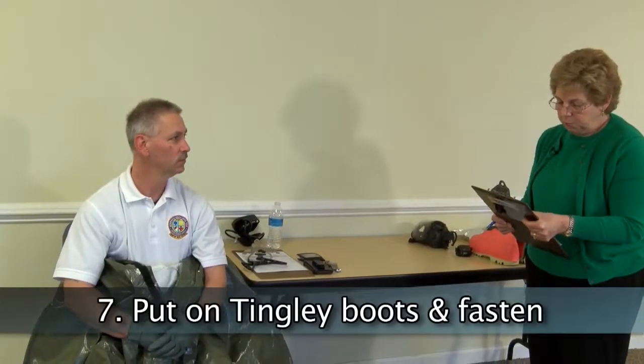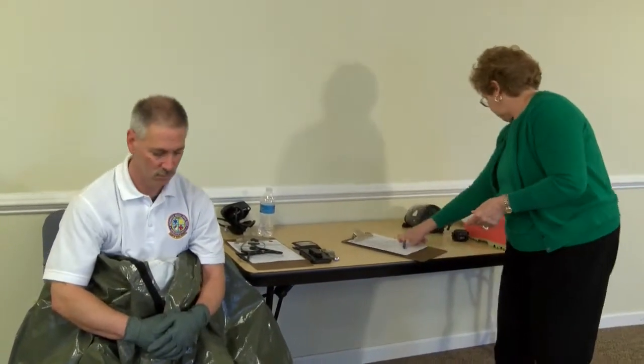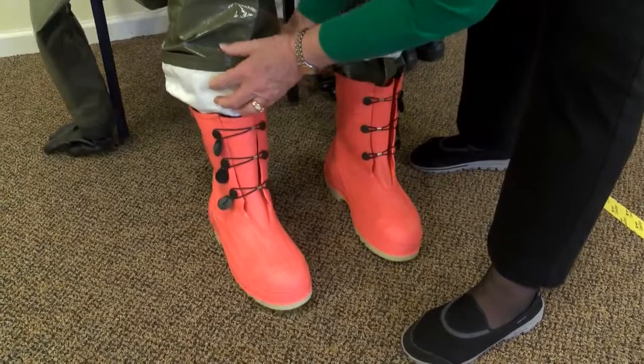Don the tingly boots and fasten with the assistance of the trained observer. Assistance from the trained observer may be required. Boots should be put on while sitting down.